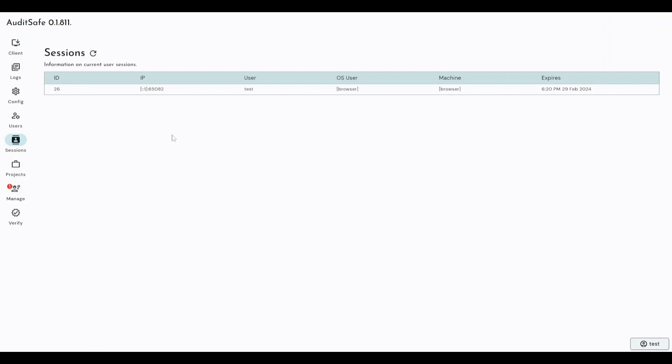Sessions is a way of displaying all of the users that you've currently got connected to the Auditsafe software that are currently performing an analysis. It will tell you the machine ID, the IP, what username is logged in, what operating system they're using, what machine name they're using, and the time and date when their login expires.